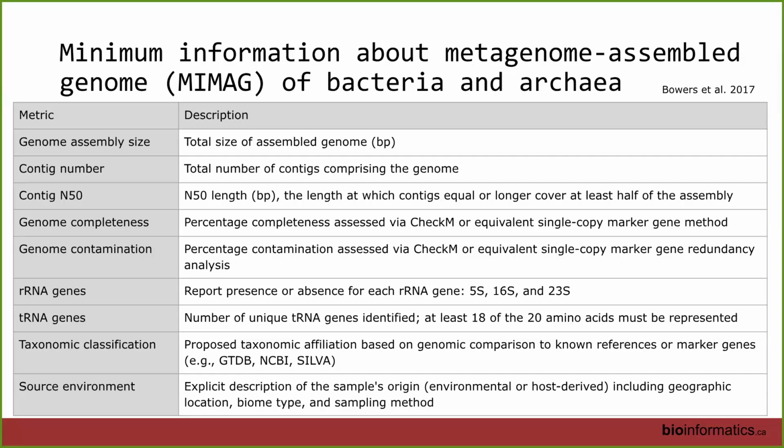Now, with respect to binning, I never use a single binner. I always use an ensemble. That doesn't mean that I don't get good bins from single binners, but I just don't. Binning is actually not that expensive computationally, so I use an ensemble approach. I run a bunch of different binners and I combine those somehow. I've also built one of my own binners that I haven't published yet, so we don't need to get into it, but if anybody wants to know about it, it's pretty cool. It also allows for an ensemble approach, where I can give it bins from other binners and use those almost like an anchoring. So, yeah.